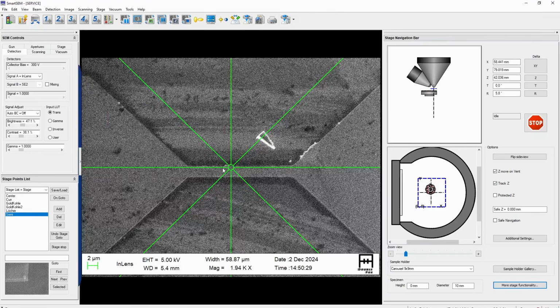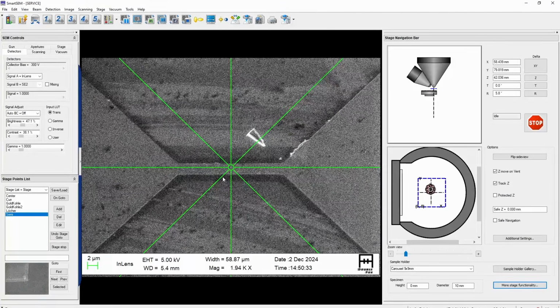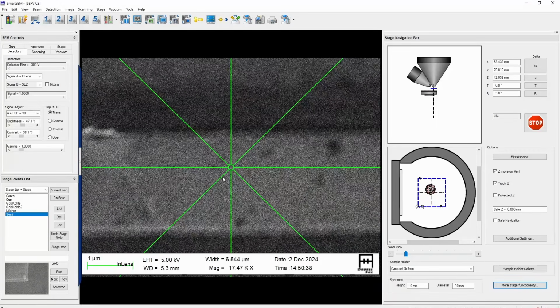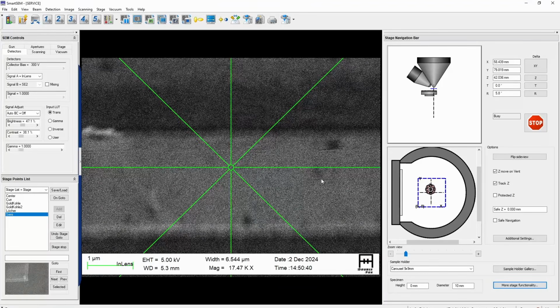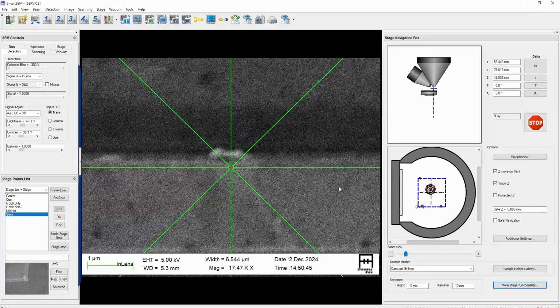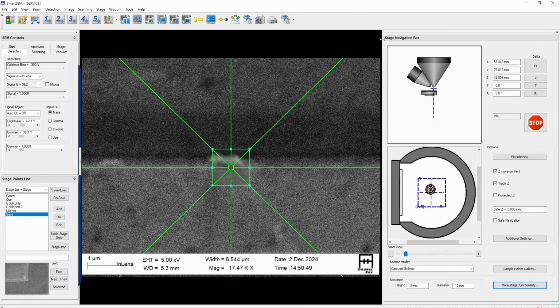So let's do the alignment here on the SEM side. This here, and give it a focus. This is quite affected by stigma, so we can just use some kind of autofocusing here. Let's do this. This is the image module from CorrMeas, which is running now, making a fast autofocus operation.